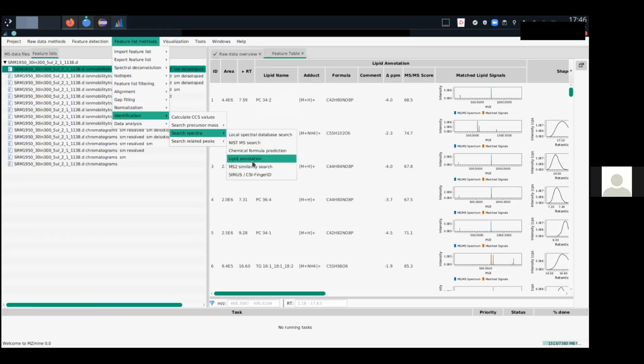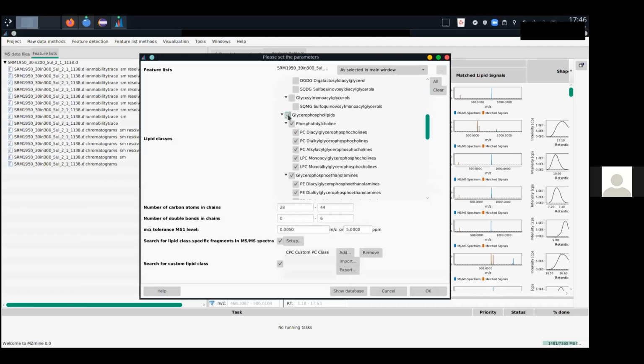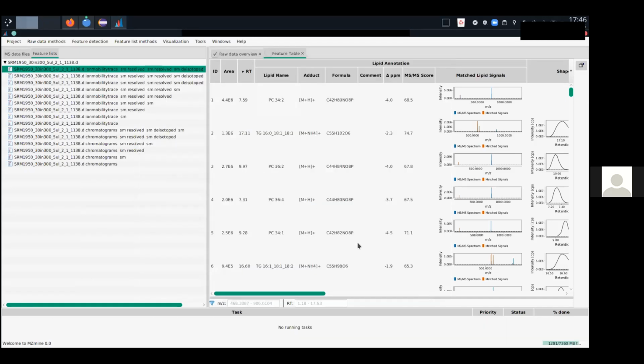Identification. Here's the custom rule. I will deactivate the rest. Run it. Fingers crossed. And here it is. I typed everything correct.